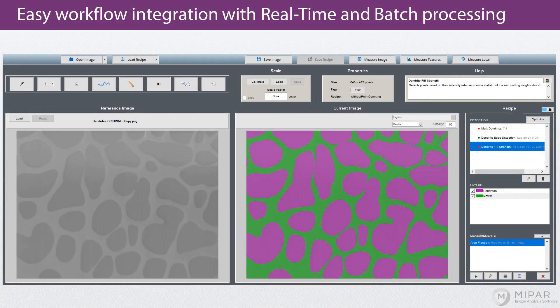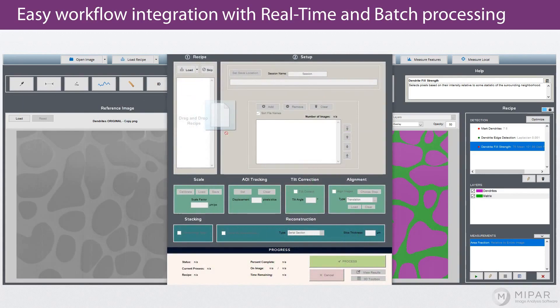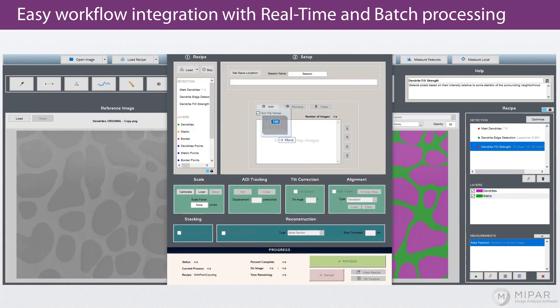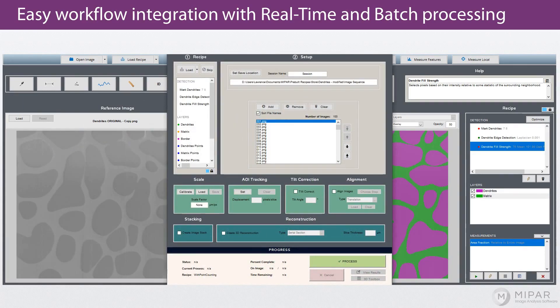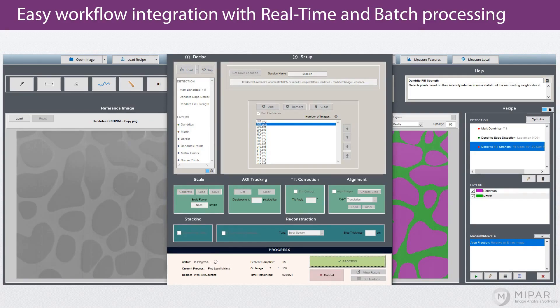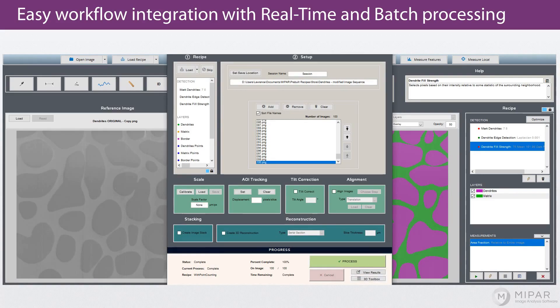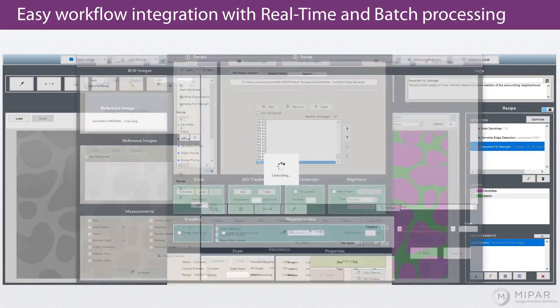If you need to analyze a large number of images, MyPAR can process hundreds or thousands of images in batch. What's more, MyPAR can be integrated easily into your existing image analysis workflow. It can analyze images automatically as they are saved off the instrument.